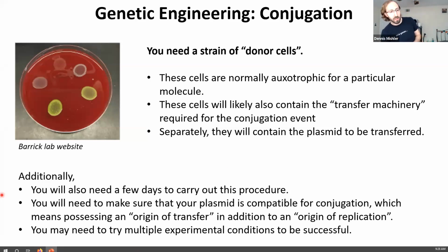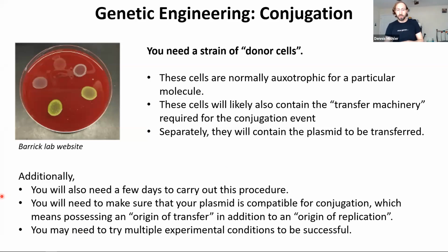Okay. Additionally, just a heads up on the procedure, you're going to need quite a bit more time to carry out this procedure. Transformation can be done pretty quickly. A conjugation may take several days.